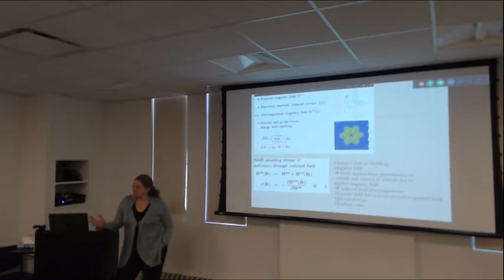There's no guarantee what direction this new magnetic field will be in. It can be in any of the Cartesian directions or any mixture. So the response of a molecule depends on the symmetry of the molecule. And what we're mainly talking about here is that it depends on the orientation of the molecule.